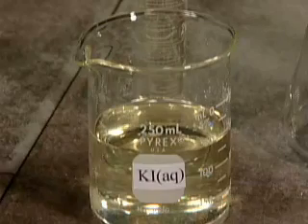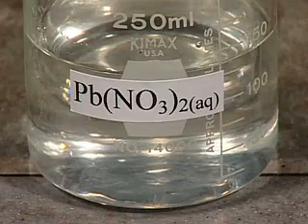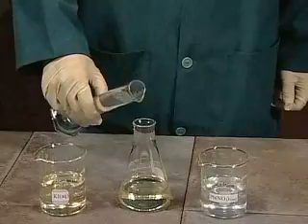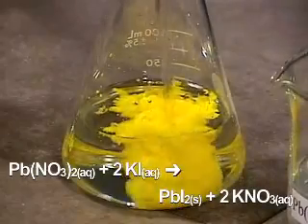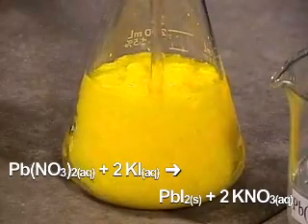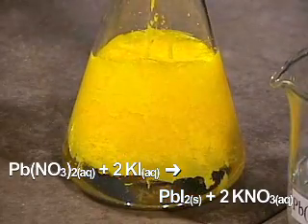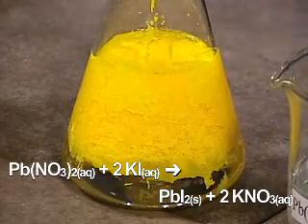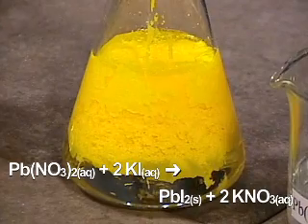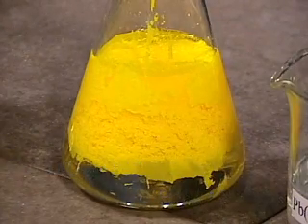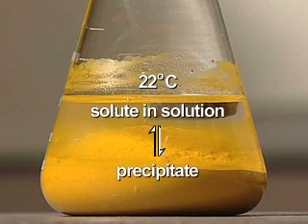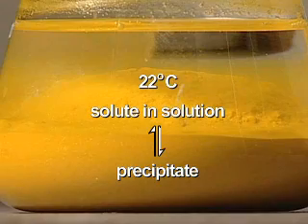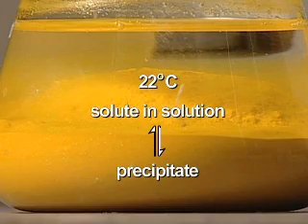Potassium iodide and lead-2-nitrate solutions are mixed in an Erlenmeyer flask. A yellow solid precipitates out of solution. The lead-2-iodide precipitate has low solubility in water at room temperature. With time, the precipitate settles. A dynamic equilibrium is established between the dissolved solute and the precipitate.